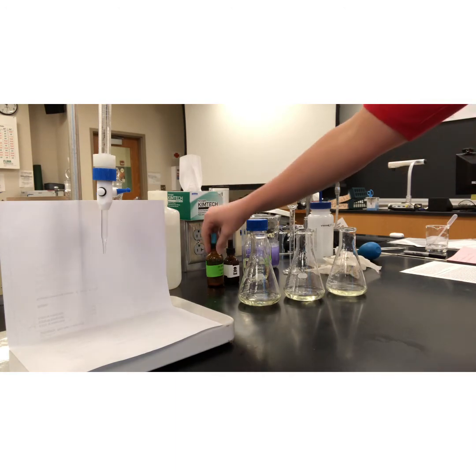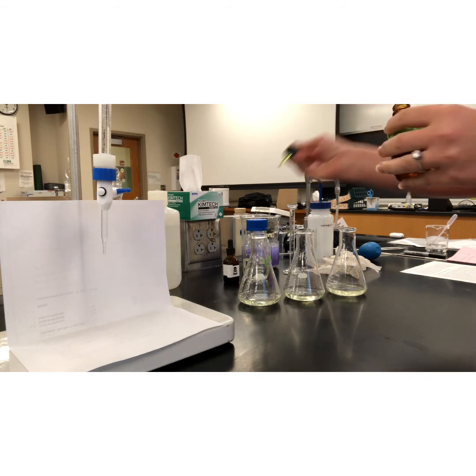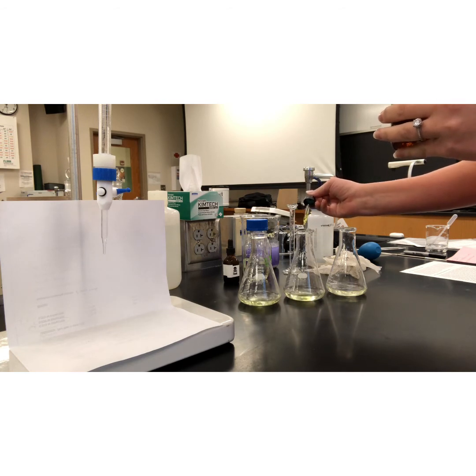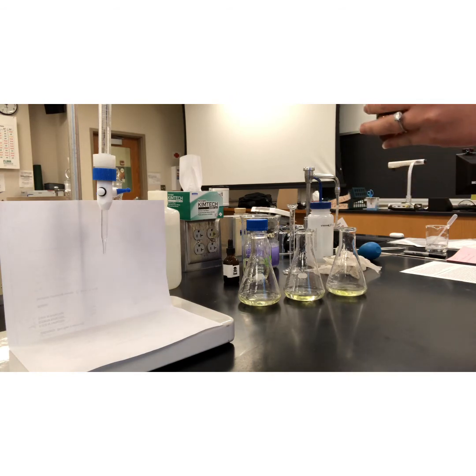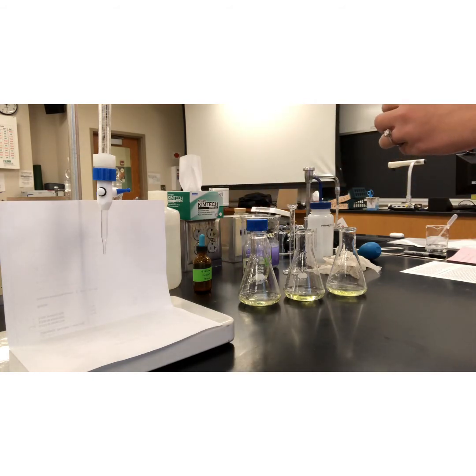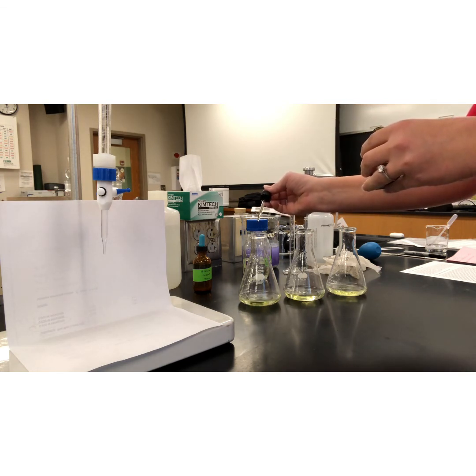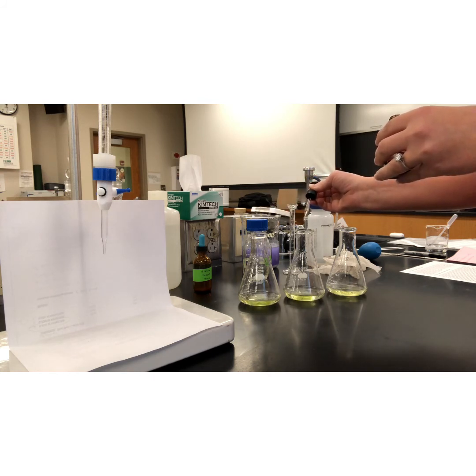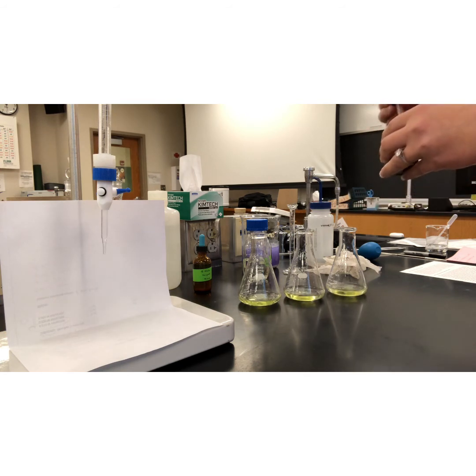1% potassium ferricyanide, 3 drops into each. 1, 2, 3. 1, 2, 3, and 1, 2, 3. Our diphenylamine indicator, 4 drops. 1, 2, 3, 4. 1, 2, 3, 4. 1, 2, 3, 4. Okay. Boom. Done.